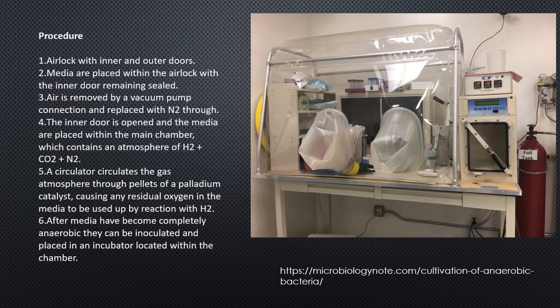So this is the anaerobic chamber, which is made up of plastic. So this is the airlock. There are some gas tanks placed nearby so that the required atmosphere can be generated by using hydrogen, carbon dioxide and nitrogen. So from the airlock, after evacuation of oxygen and refilling the airlock with nitrogen, the plates are kept inside your anaerobic chamber and you can work there easily from the glove ports. Okay, after inoculation, you have to incubate in your anaerobic chamber itself, right? So the procedure is given here, you can read it.